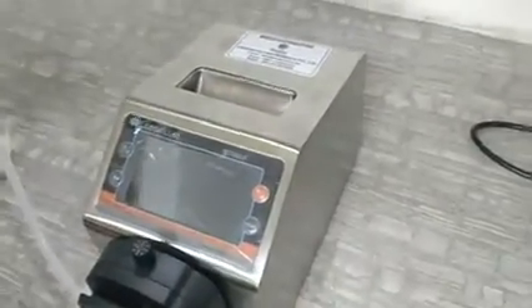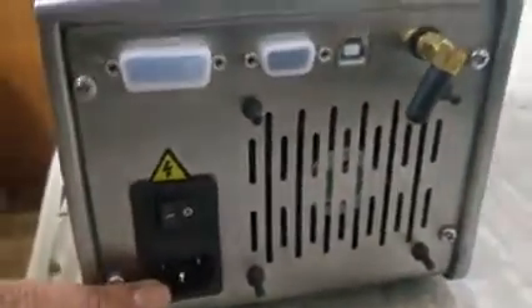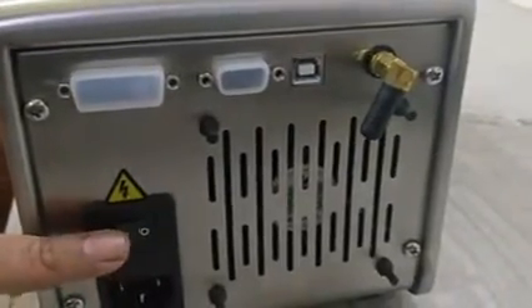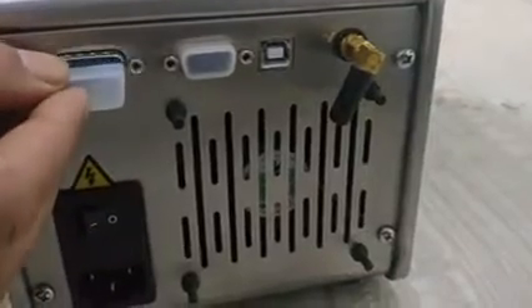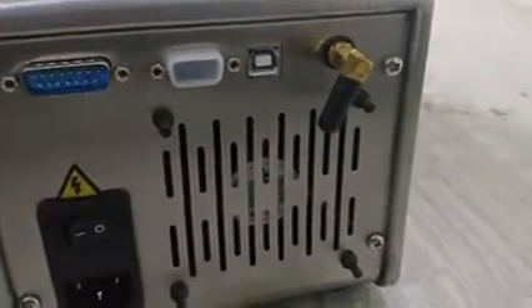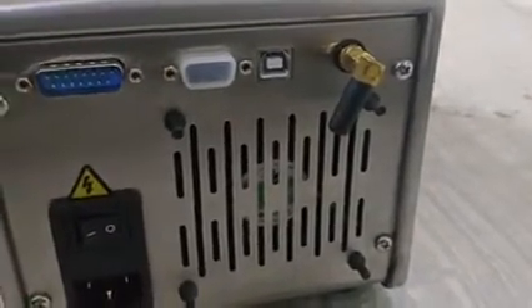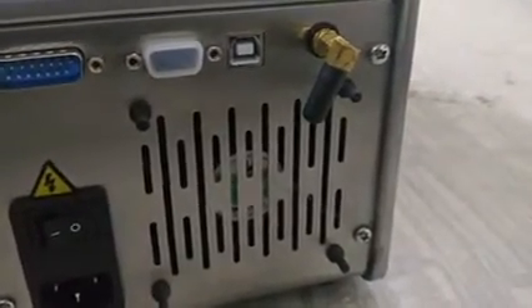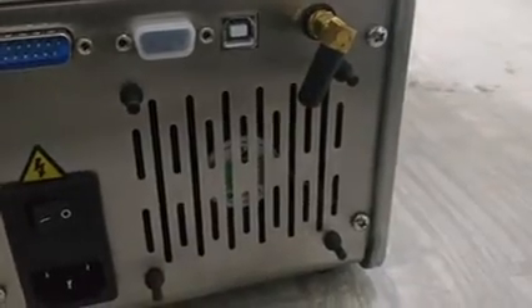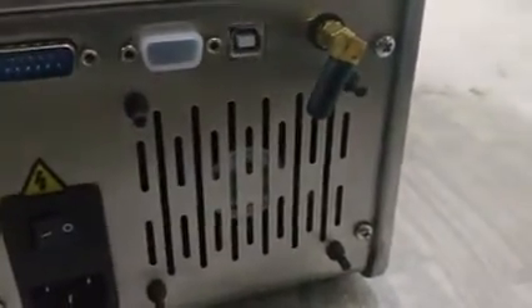Looking at the back of the machine: this is the power cord connector, this is the on/off switch, and this particular port is a 15-pin port that we can use for external controls and a foot switch. We will show how to use this port for a foot switch in the demo later. Let me connect the power.